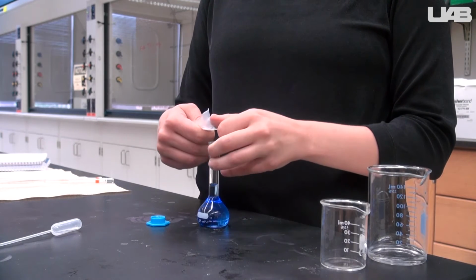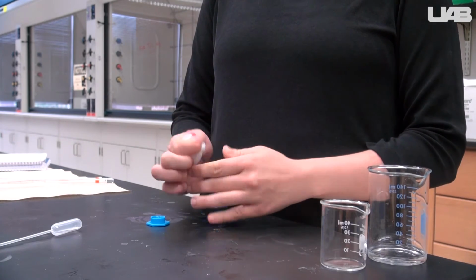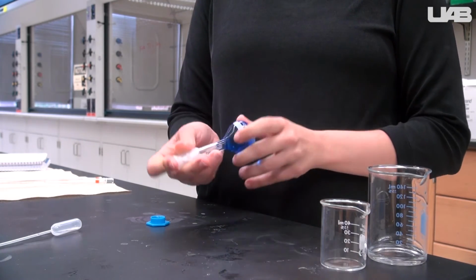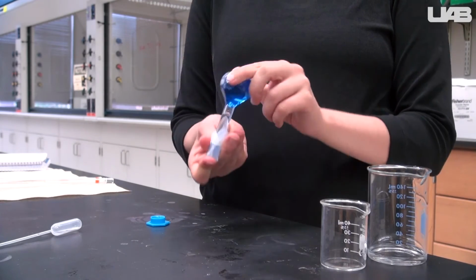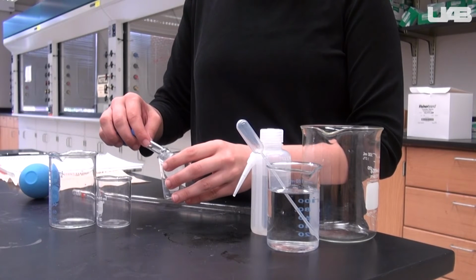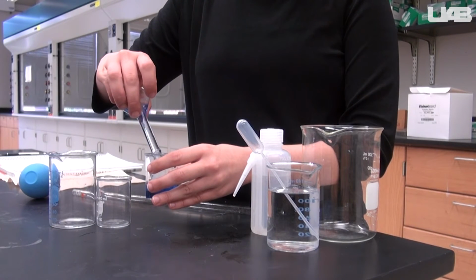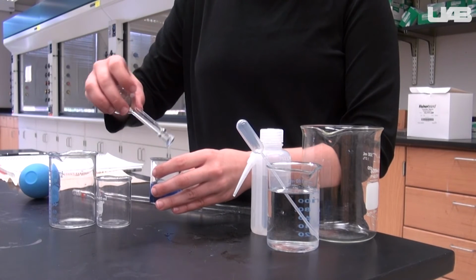With the meniscus of the solution at the mark, cover with the cap or parafilm if no caps are available, and invert several times to ensure the solution is thoroughly mixed. Once it is finished, pour your solution into a clean, dry beaker and get ready to perform your dilutions now that your stock solution is ready.